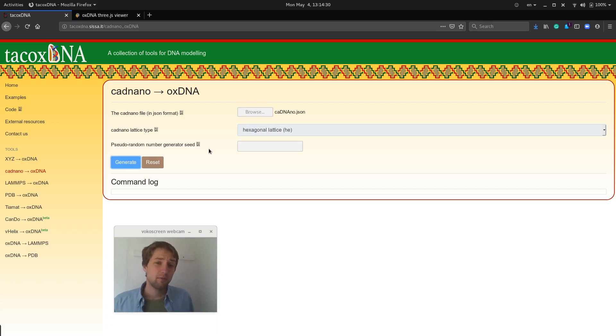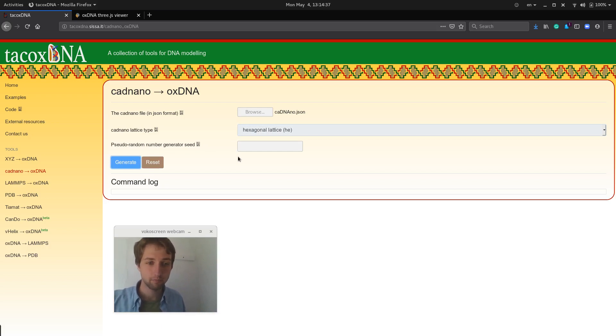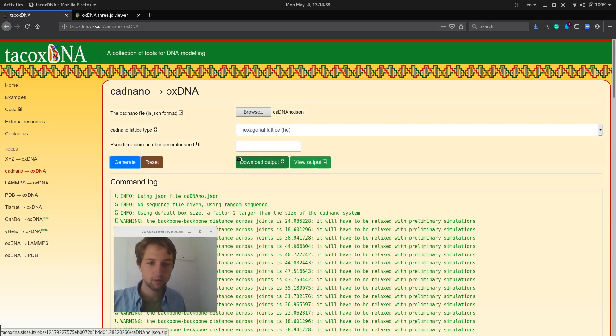This might take a few minutes for larger structures, but this is quite a small design, so it shouldn't be too bad. There we go.